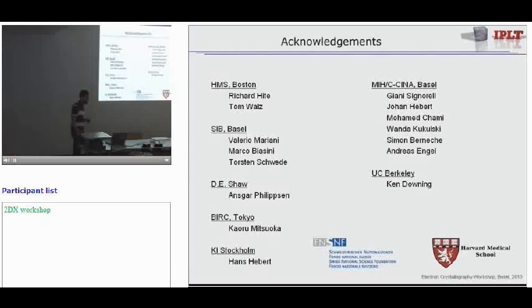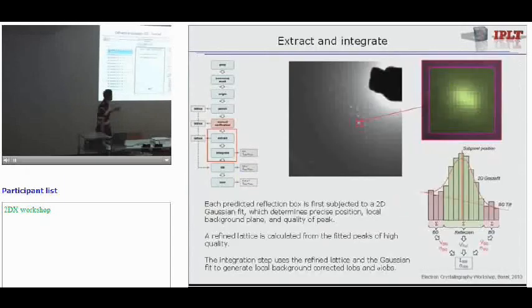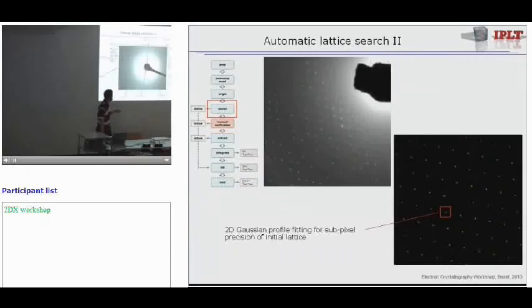When you have all the background values, but you're a little bit off with your zero, can you correct automatically for being off by one unit cell? Let's quickly go to the image.